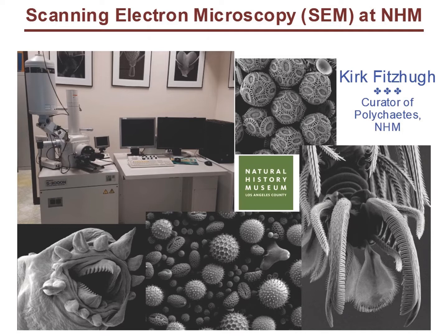I'm Dr. Kirk Fitzhugh, one of the curators here at the museum. I'm a marine biologist and I conduct research on the evolution of segmented worms called polychaetes, which are found in all the world's oceans. For conducting my research, the museum houses an important piece of equipment that I and other museum scientists routinely use, called a scanning electron microscope, or SEM for short.